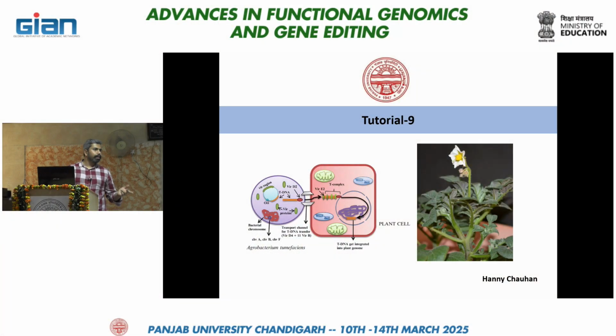So this tutorial will be more in line with lecture 6 and lecture 7 that you did yesterday. And in the tutorial you had in the morning, it's more bioinformatics centric. So this tutorial focuses on the agrobacterium mediated transformation in potatoes specifically, but it's more or less the same for every plant. So I think we should recall what we have learned in yesterday's tutorials.